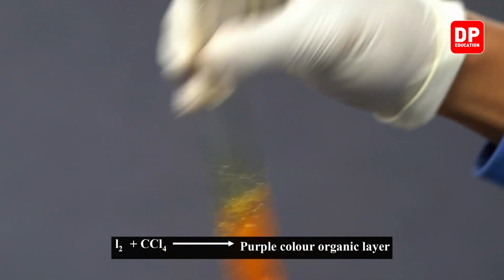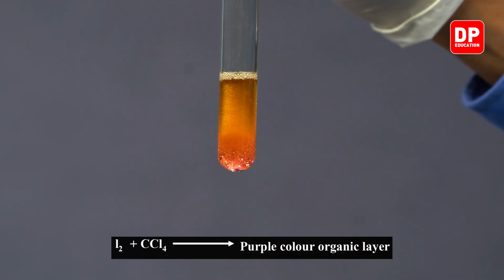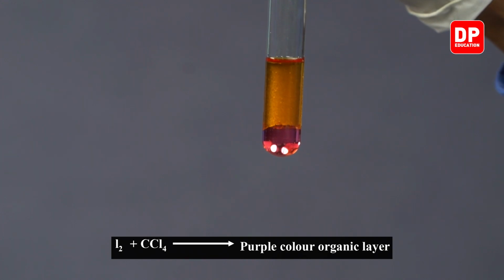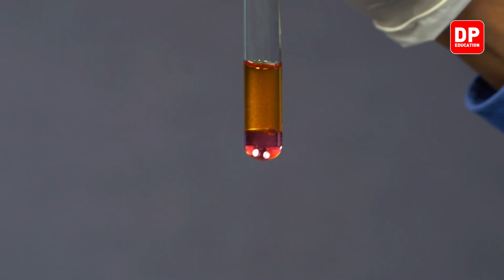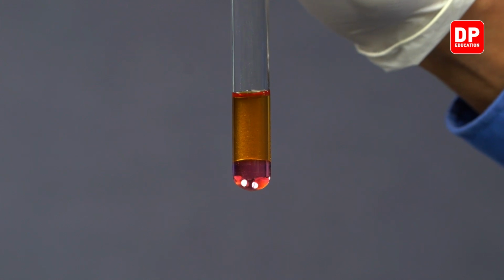If you keep shaking it for a while and let it stand, you will see most of the color on the aqueous layer will decrease over time, and the intensity of the purple color on the carbon tetrachloride layer will increase.